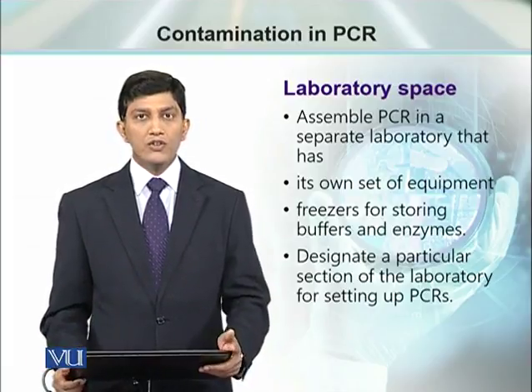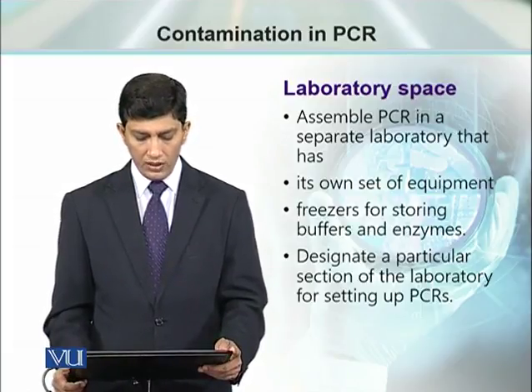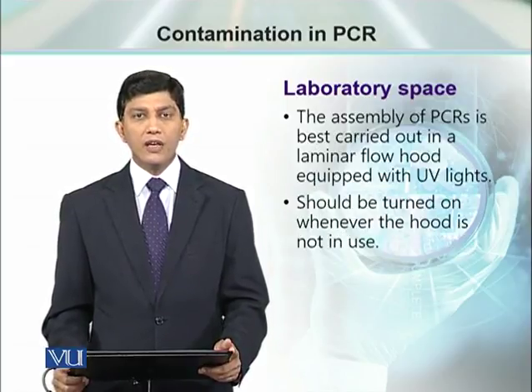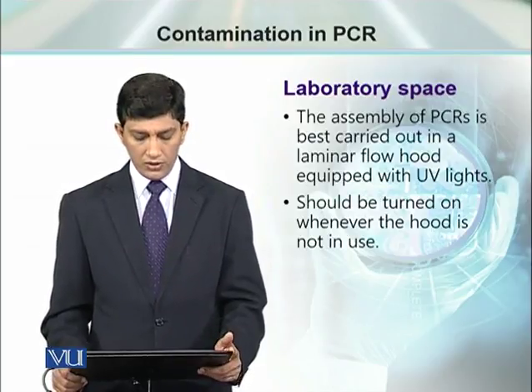These should be specifically separated for setting up a PCR. Designating a specific area for PCR in the laboratory is the best idea to get rid of contaminations.